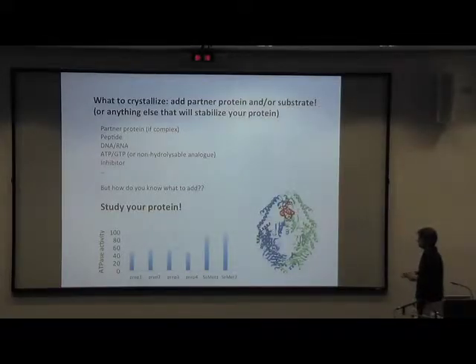And at some point, we went to express selenomethionine protein. And suddenly we found that this protein was more active in the ATPase assay. We didn't really pay attention to it. But then when we grew the crystals of the selenomethionine protein, they turned out to be twinned, which you may learn later in the course is something that you really don't want to have. And it basically made it impossible to solve the structure. And so we were scratching our heads and wondering what to do about it.